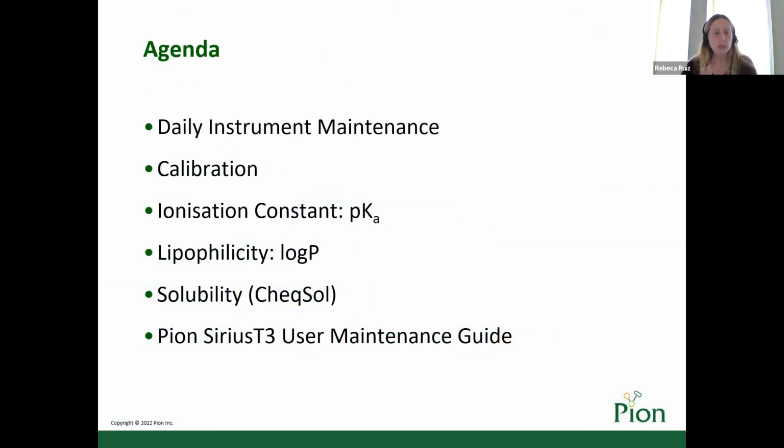The webinar is organized in a way that the basics are shown at the beginning, and while the presentation is progressing, more advanced material will be shared. This presentation will start looking at the daily instrument tasks, which are shown in the maintenance tab. It will be a review of the instrument calibration, covering electrode calibration, blank, and base standardization.